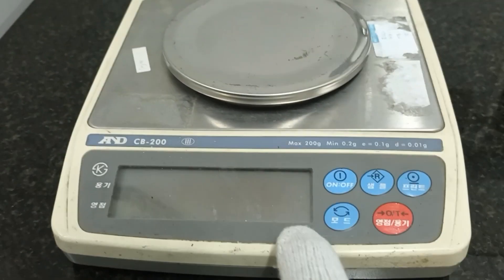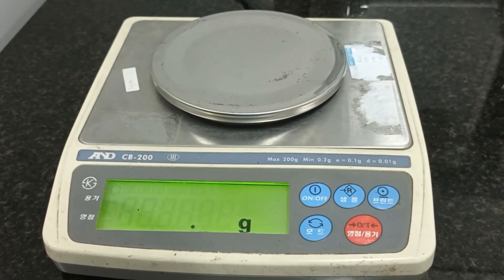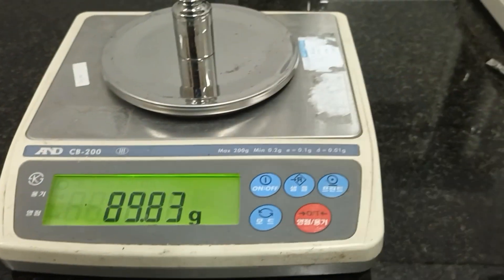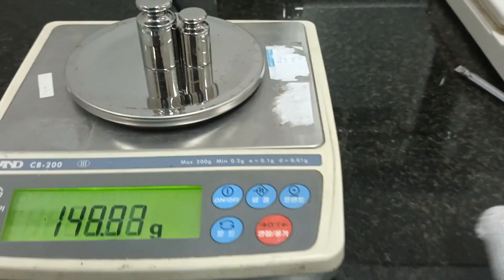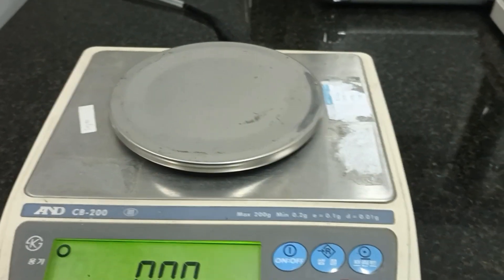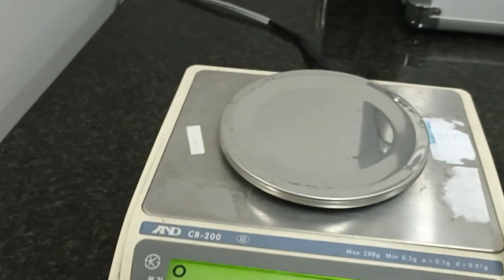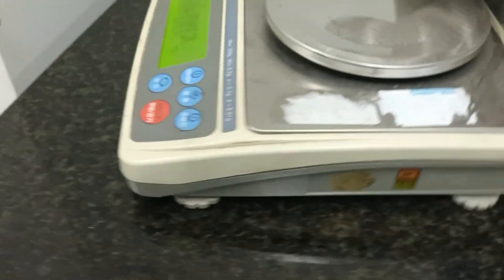Hello everybody. I will calibrate the balance. First, I will turn it on and check the standard. The result is not good.